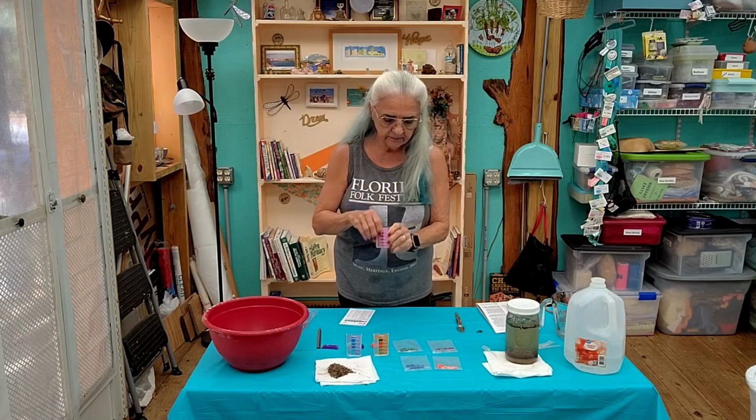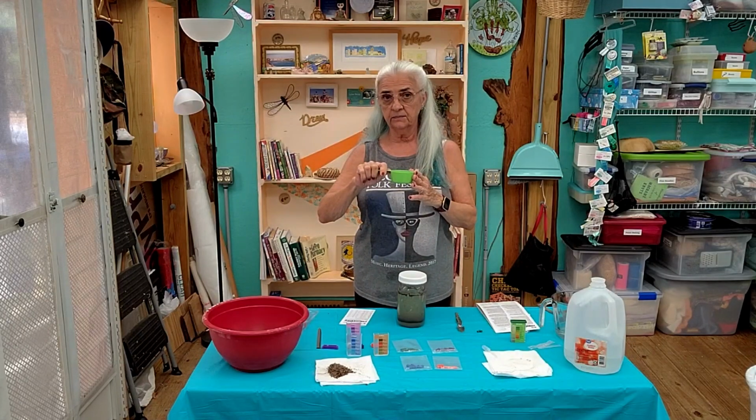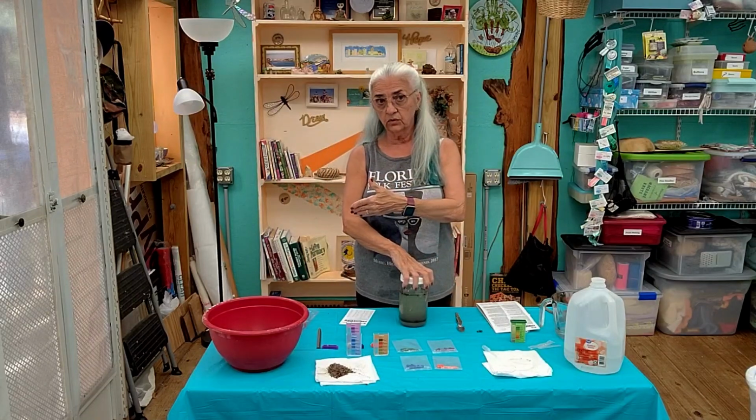So this is the nitrogen. It's kind of a purple. I'm getting ahead of myself. The kit describes making the solution that you need to test this with a 5-to-1 ratio. So it would be 1 part soil to 5 parts water, for lack of a better way to say that. I actually used half a cup of my soil and 2.5 cups of water, and I'm using distilled water. So the water is 5 times more than the soil.